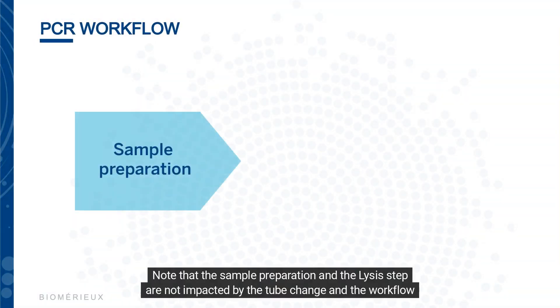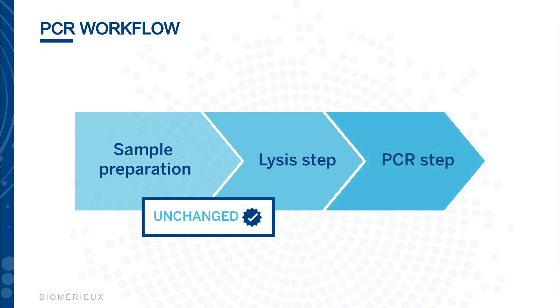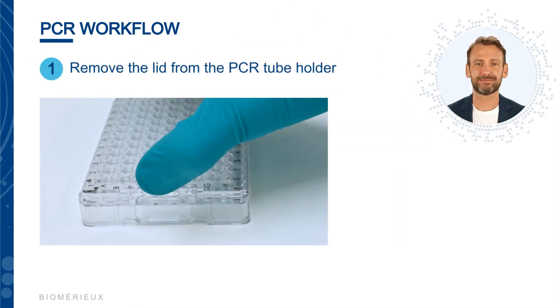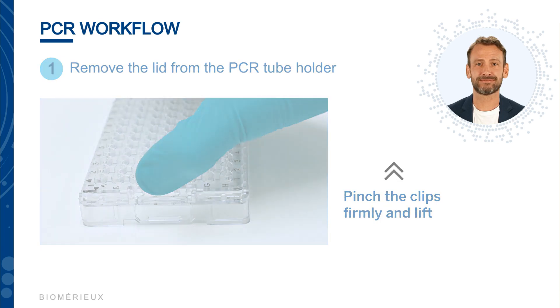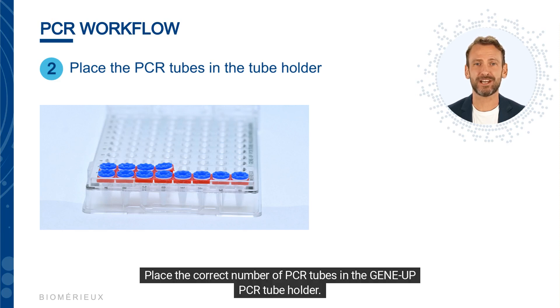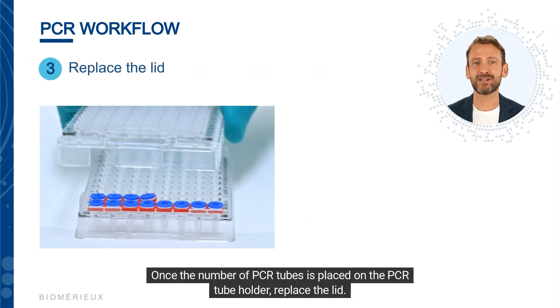Note that the sample preparation and lysis step are not impacted by the tube change and the workflow remains the same. To begin, remove the lid by pinching the clips on both sides, pressing firmly, and lifting. Referencing the plate map, obtain the required number of PCR tubes from the GeneUp PCR kit and place them in the GeneUp PCR tube holder. Once the correct number of PCR tubes is placed, replace the lid.